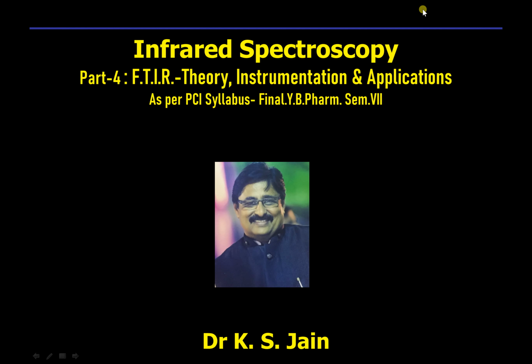Friends, in the fourth part of this series, we are going to see now the FTIR, that is Fourier Transform IR spectroscopy, its theory, instrumentation, and applications.